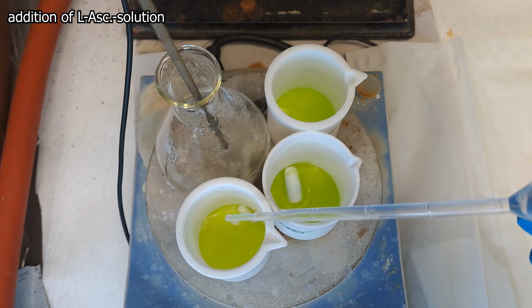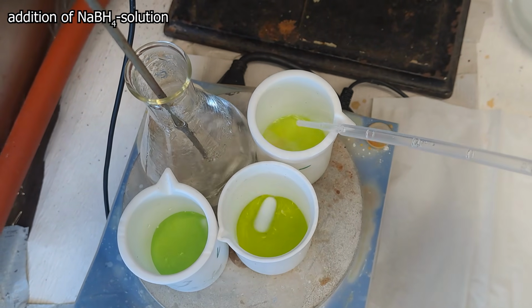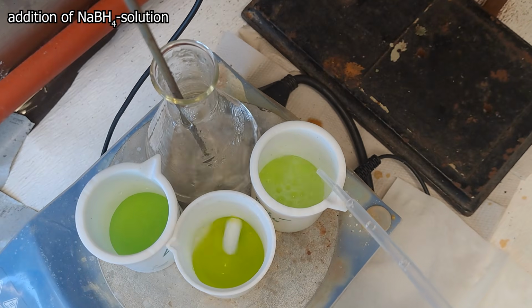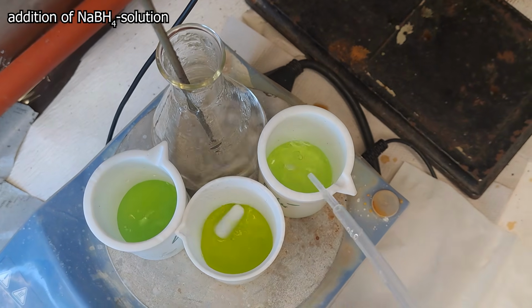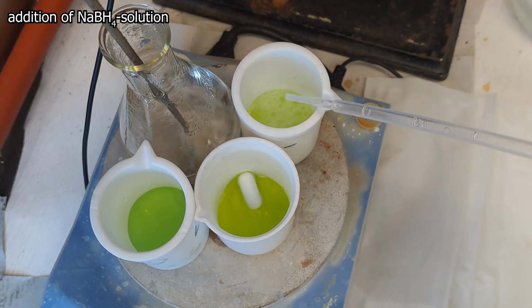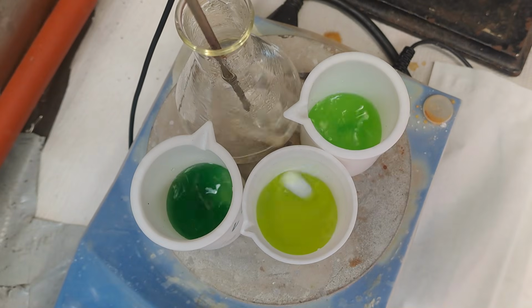Nothing happens with the L-ascorbic acid at first. But in the next shot, where I wanted to add the sodium borohydride solution, you can definitely see a color change in the L-ascorbic acid vessel. When borohydride is added to acid, a gas is naturally produced. Hydrogen gas. And you can see upon contact an orange, brown, reddish color forms that disappears quite quickly. And that's so cool, and I will explain why I find that so cool in the theory section. Any guesses? Now the sodium formiate is added.